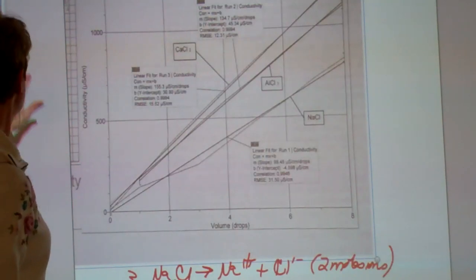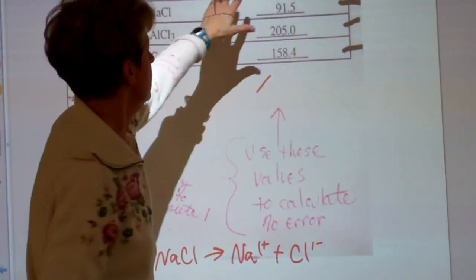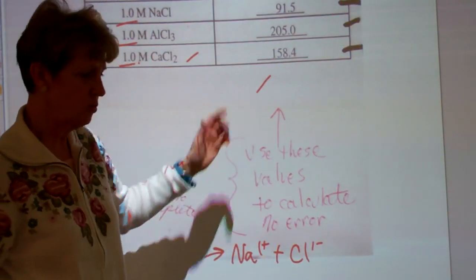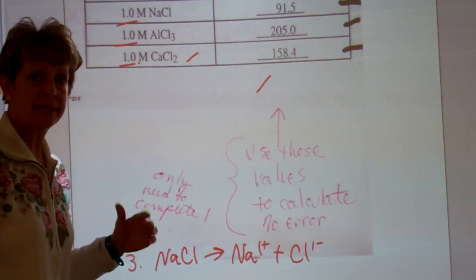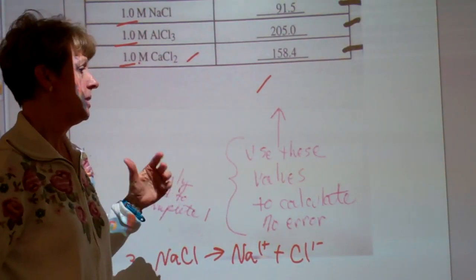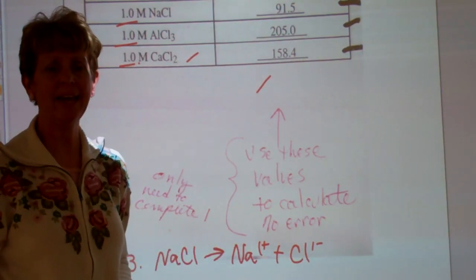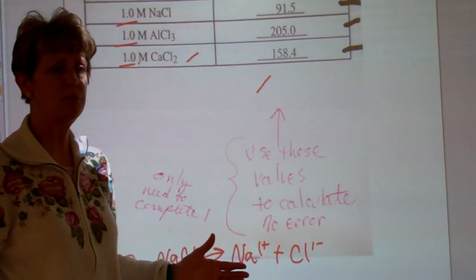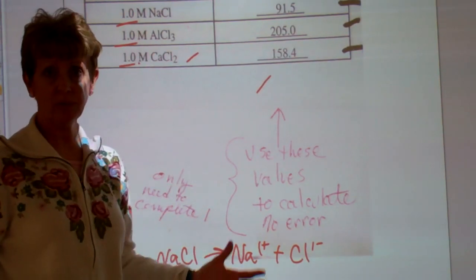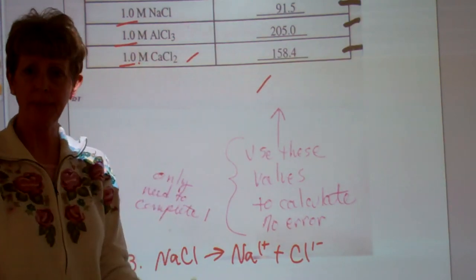One of these values, calculate one, you can do more if you'd like, and discuss the percent error, what went wrong, and suggestions for improvement. As always, we'd like you to add in your suggestions for improvement. Was it valuable to learn about doing a lab write-up this way rather than being in class?